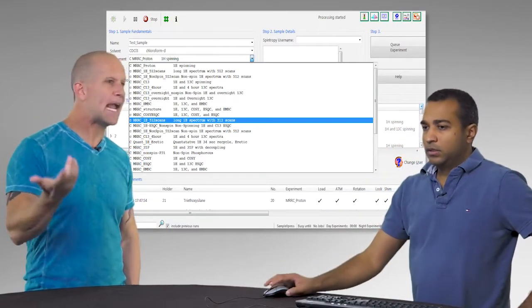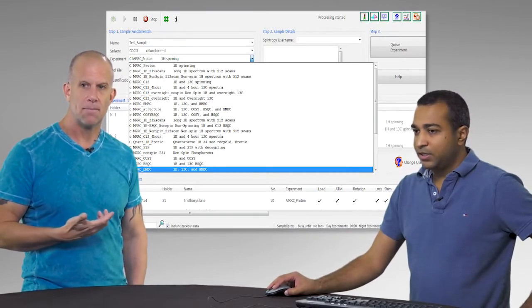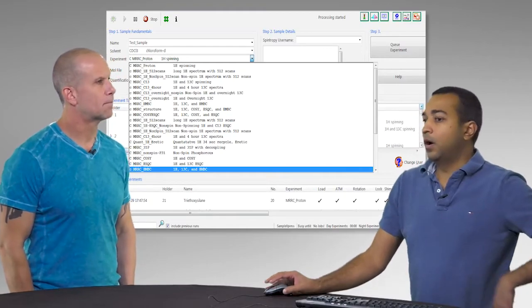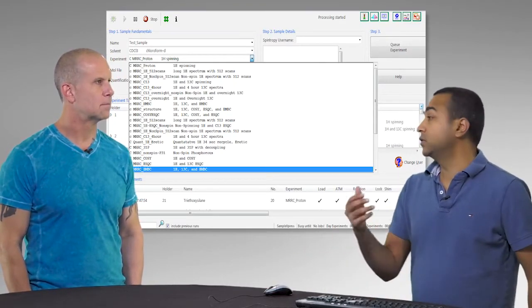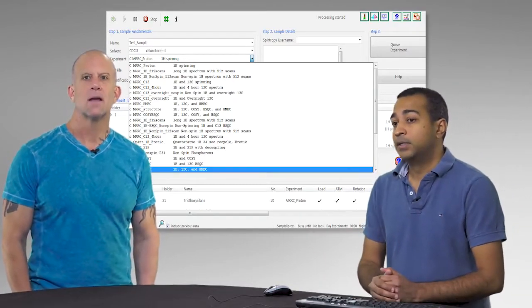and stuff like that, so that you could gauge how much longer till your stuff is done. Right. It actually gives you a little time down here to let you know that this amount of time is blocked off for the night queue and the day queue. So when you come in here, submit a sample, you know exactly how long you're going to wait for that to run. Okay, so what's the next?